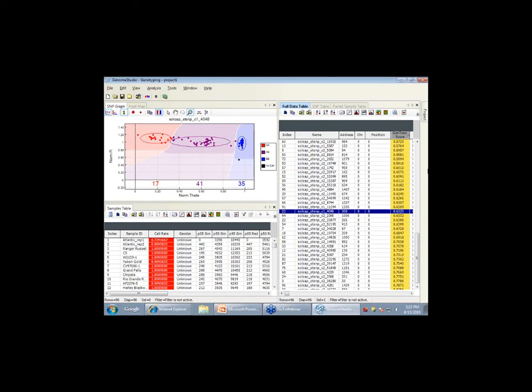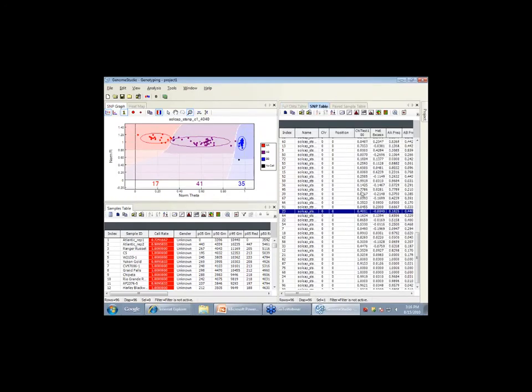So we've moved around, we've defined clusters. Now we want to be able to export data. Or, I'm sorry, create. Let's look at the SNP table. If we click the SNP table, you have a whole bunch of different things that you see. You've got your name. We never defined the chromosome because we don't know it. But you see chi-square tests, for a 1:2:1 in this case.